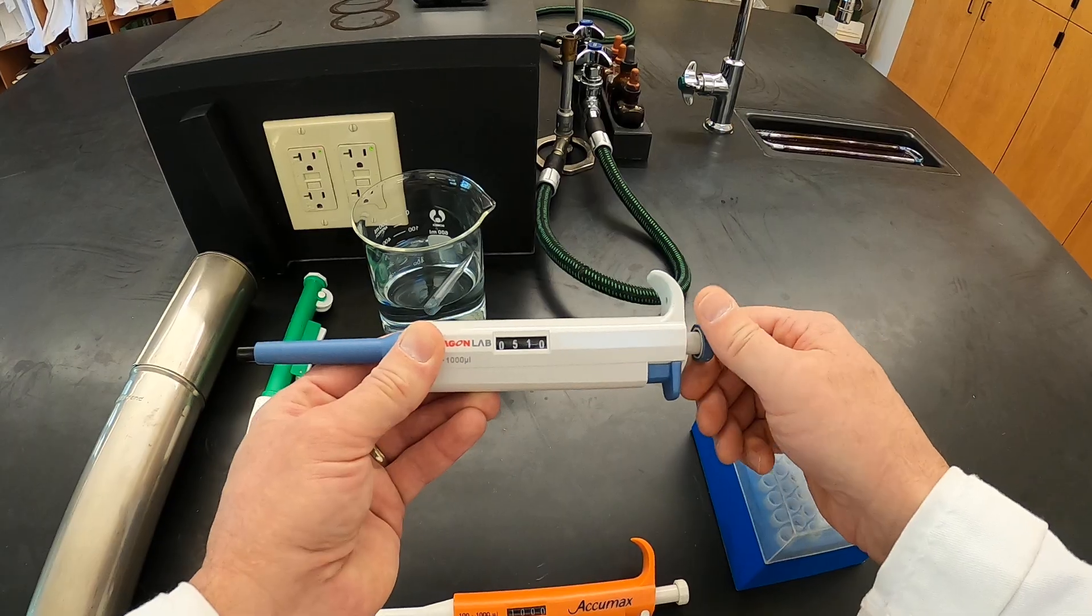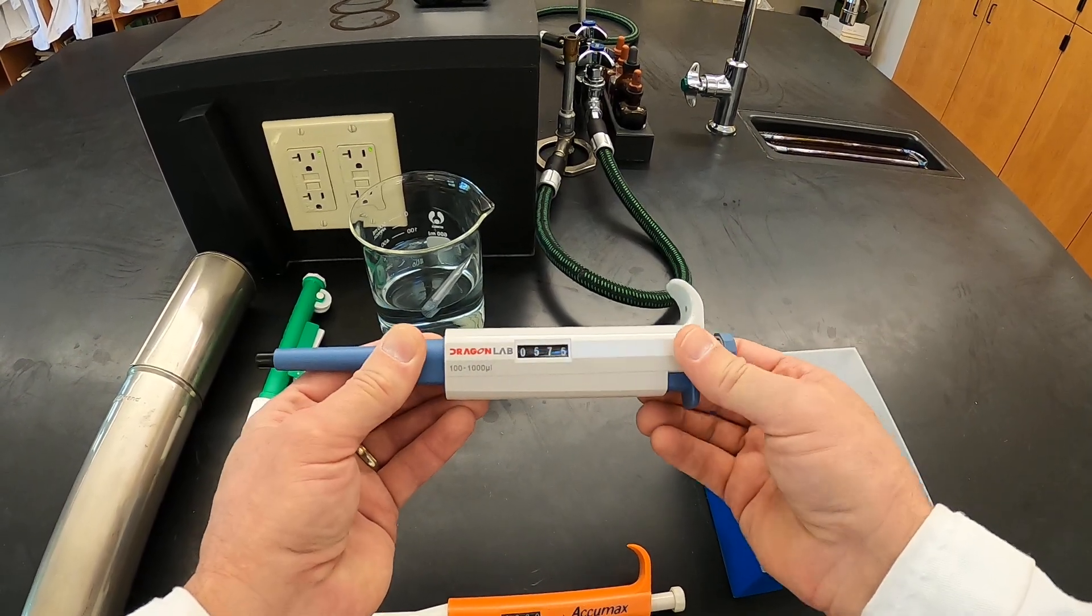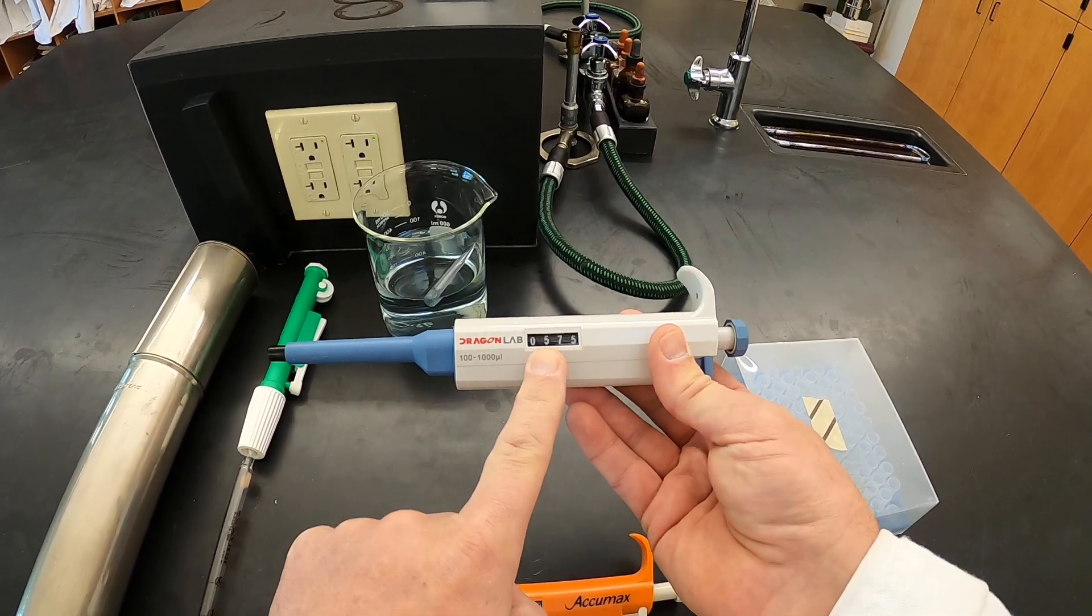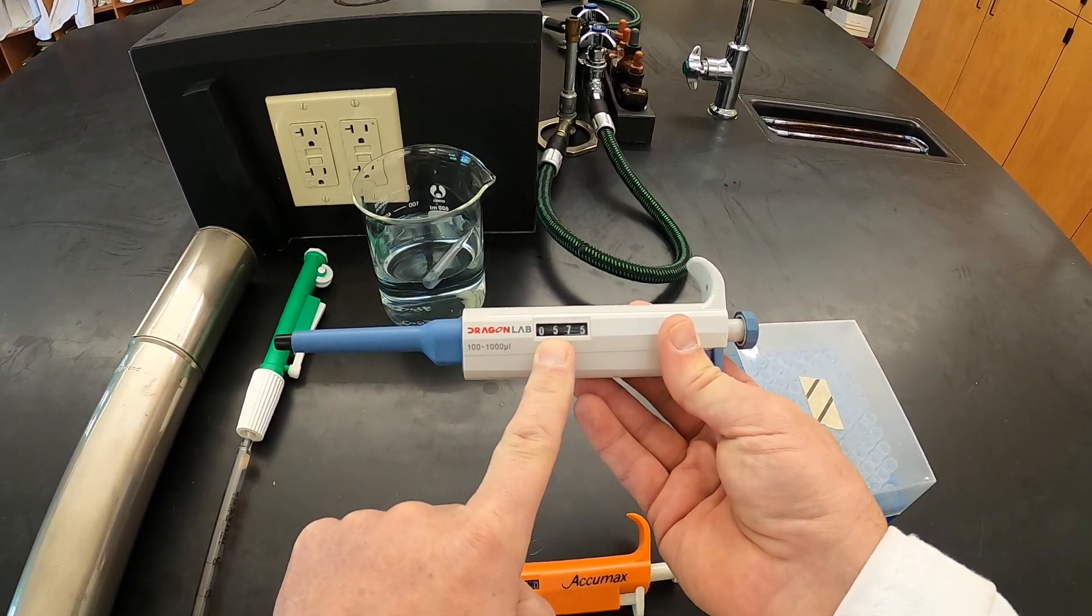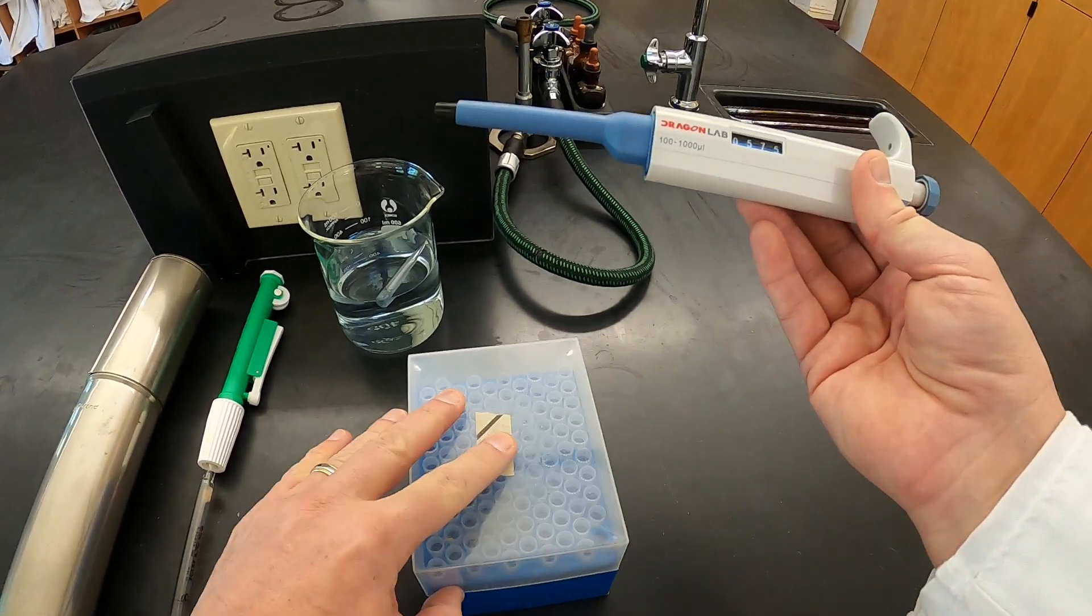So let's set this one back to 575. And in order to suck up liquid that is exactly 575 microliters with this pipette, we actually have to use these disposable tips.